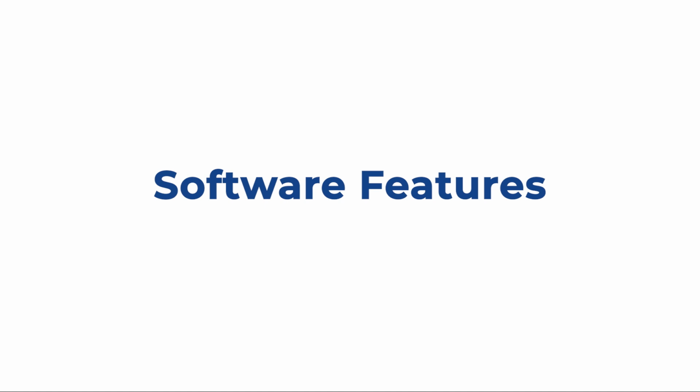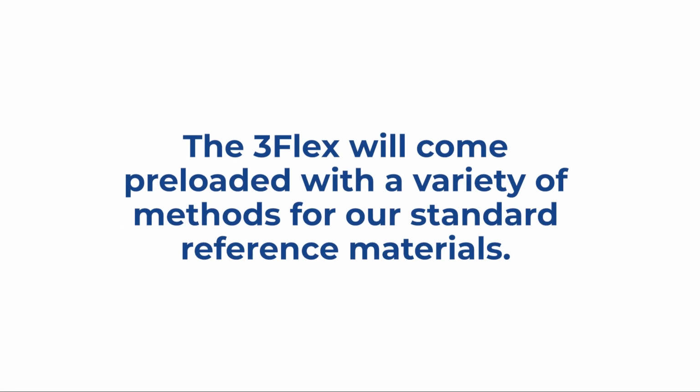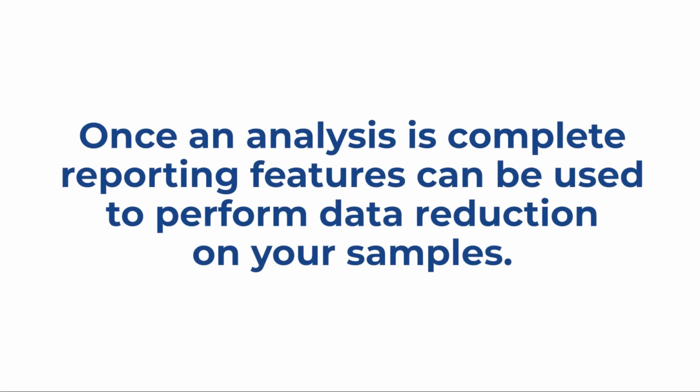Now let's look at the software features of the 3Flex. Methods can be created that allow you to save time during the setup of analyses for similar samples. The 3Flex will come preloaded with a variety of methods for our standard reference materials. Once an analysis is complete, reporting features can be used to perform data reduction on your samples.